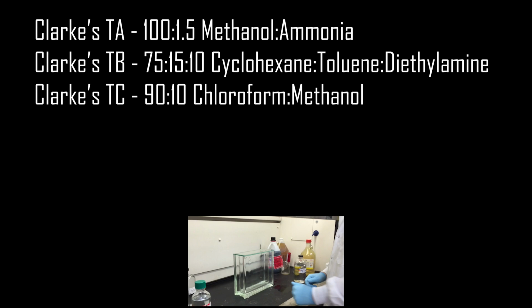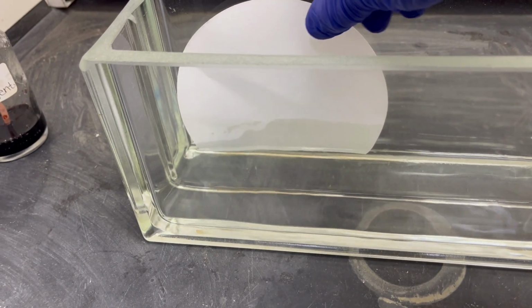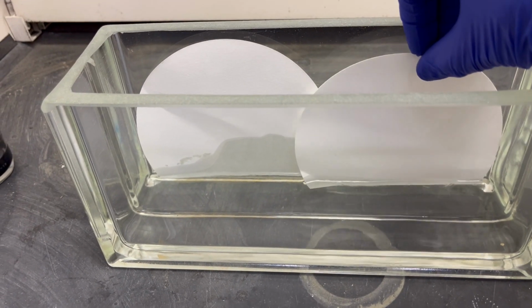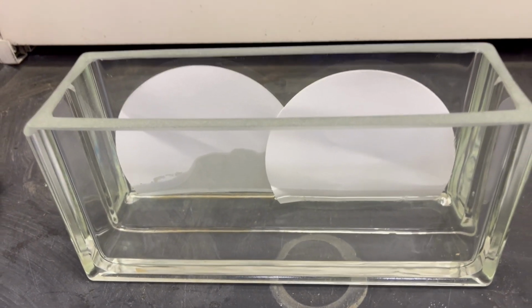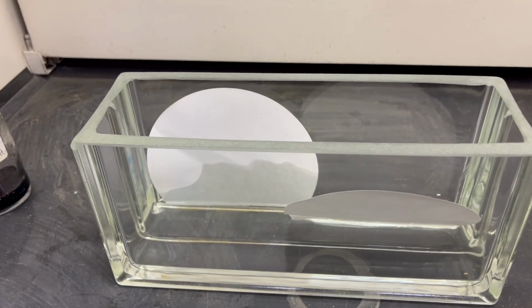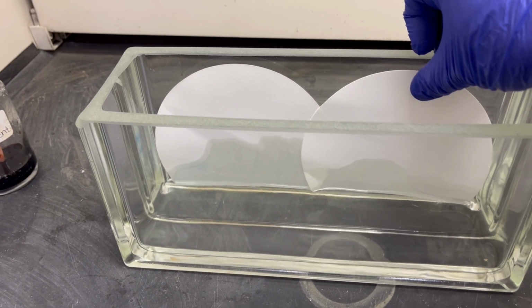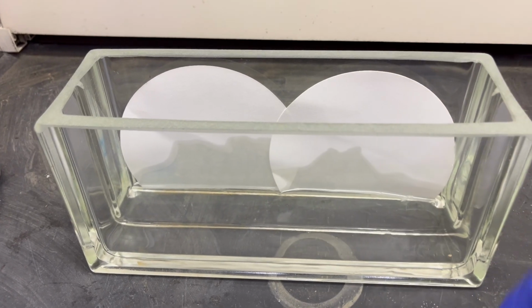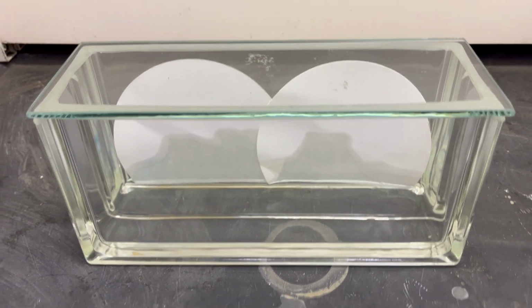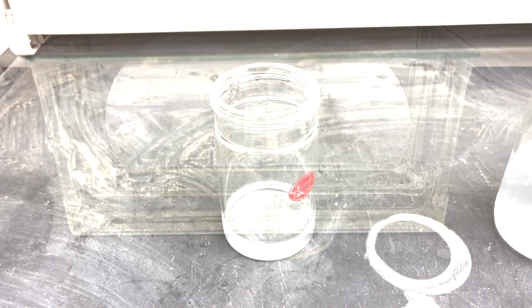Once you have your solvent in place, you want to saturate the chamber. One thing that really helps with this is taking a piece of cut filter paper and sticking it on the back wall of the chamber, and this soaks up solvent and helps to fill the chamber with fumes. That's what we're talking about when we say a saturated chamber: we want a chamber very humid with your solvent fumes. So once you've got this closed, you're going to leave it for typically 30 minutes or more, and then you're going to try to open it as little as possible. You're going to preserve that saturated, solvent-humid chamber.